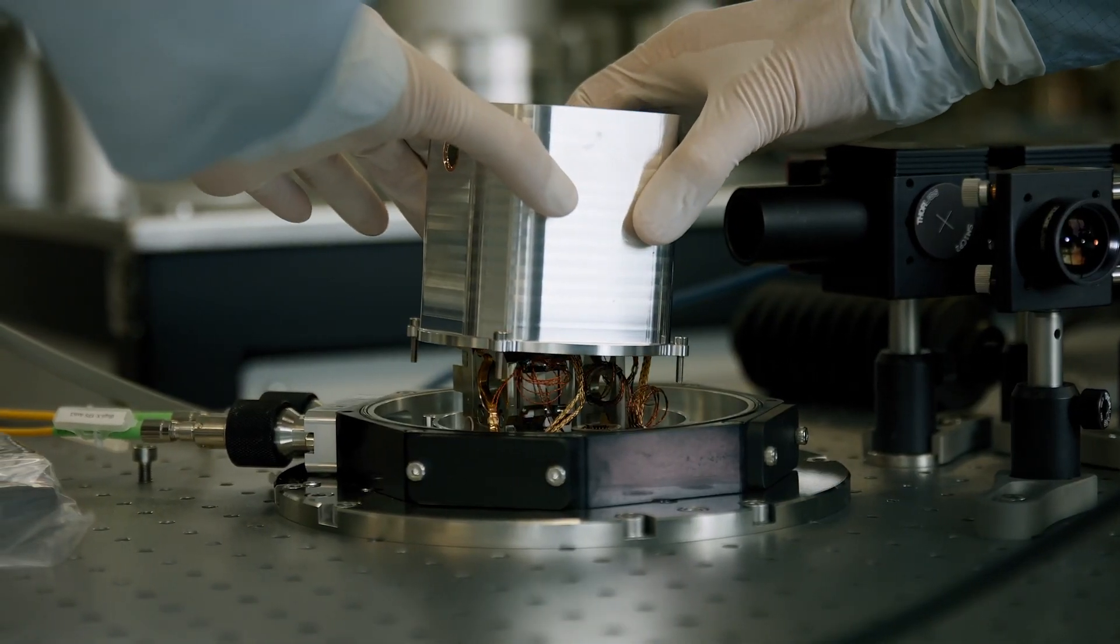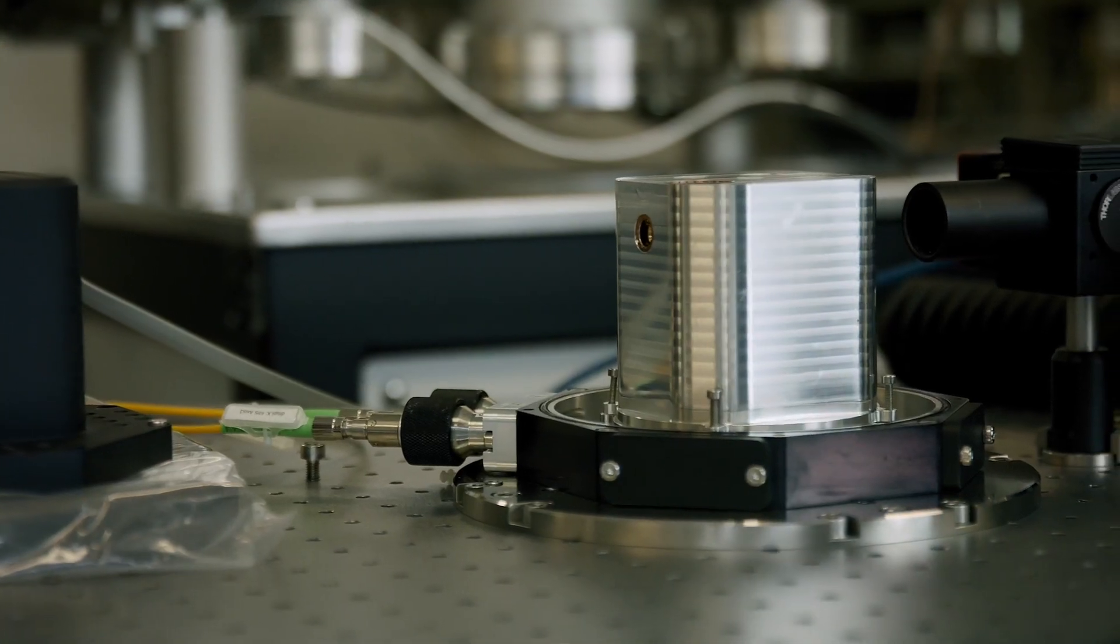Using a cryostat, we're able to probe the properties of our materials down to 4 Kelvin, which enables us to probe states of matter which are not present at room temperature.